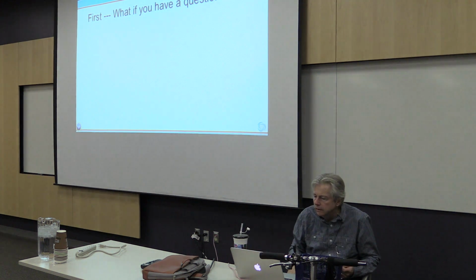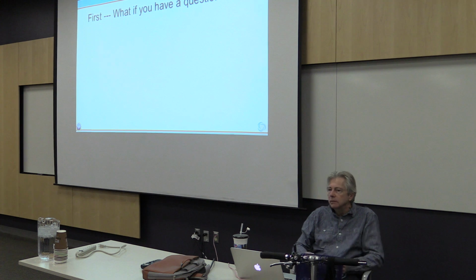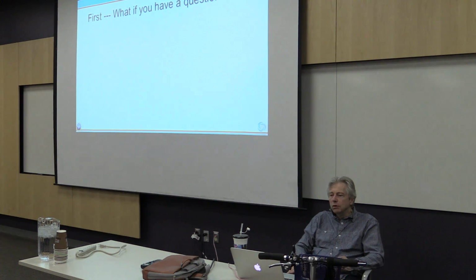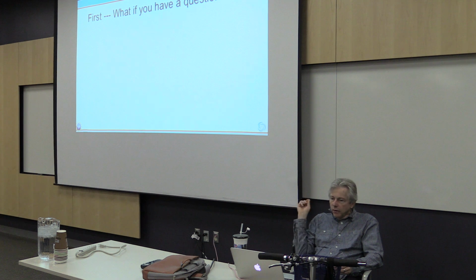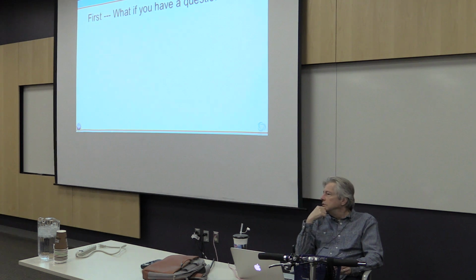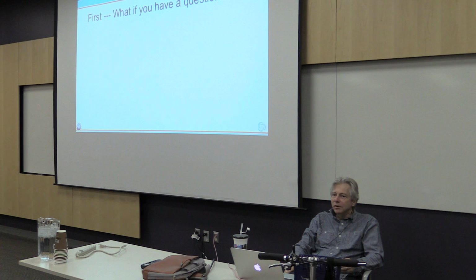So let's get into some of the nuts and bolts, because a lot of iPlant is nuts and bolts. Let's face it, it's an infrastructure. It's a way to help you analyze your data. And the first question I put up is, what if you have a question? What if a question comes up along the way? What can you do? You can always email me and ask a question. You can always ask Eric if you see him, or Jeremy over there, or Nicole even, if you can catch her.